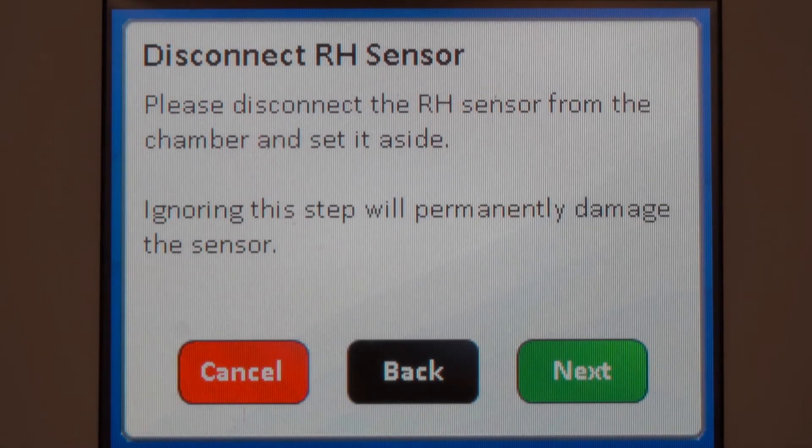If equipped, carefully observe the process shown to safely remove the relative humidity sensor without damaging it.